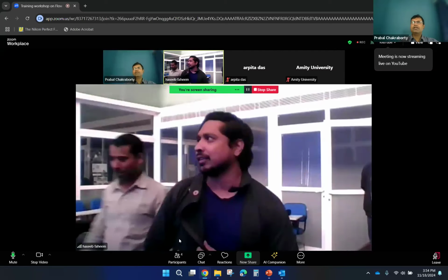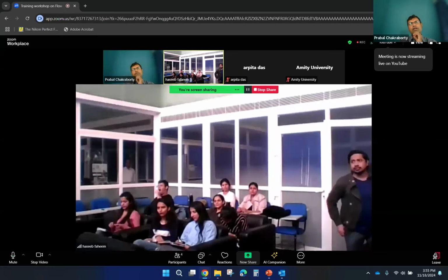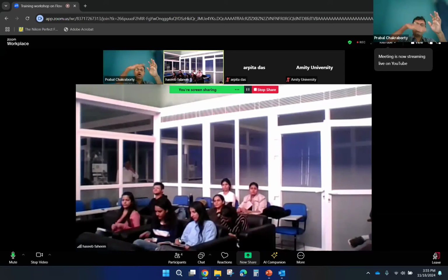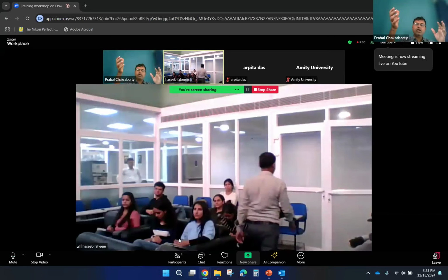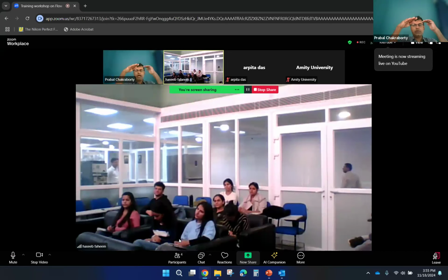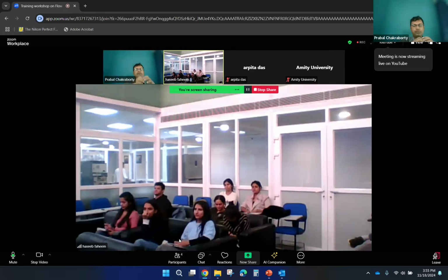Okay, so actually Nikon introduced this functionality recently. Now there are multiple AI functions available. One example I can give you: I showed you the wide field fluorescence where a lot of out of focus light is coming. With the AI function, you can train the software in such a way, or it is already trained, it will automatically understand what is the out of focus information and what is in focus information. From the wide field image, it can discard the out of focus information, keep only the focus information, and improve the image quality. So that is how AI can help you.